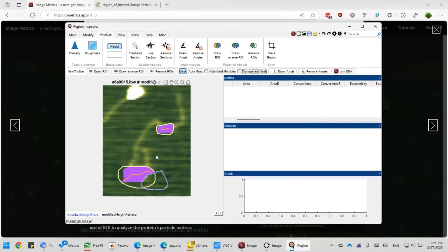On the other hand, if you draw an inverse region of interest first, basically to exclude some area, then if you want to refine that inverse region of interest, maybe you still want something from within that area, you can then draw a region of interest inside that inverse region of interest to get that feature back. That's a mouthful. So for example, let's turn the transparency on.